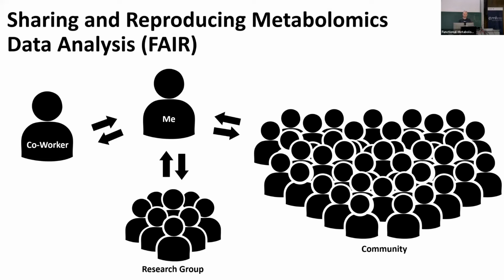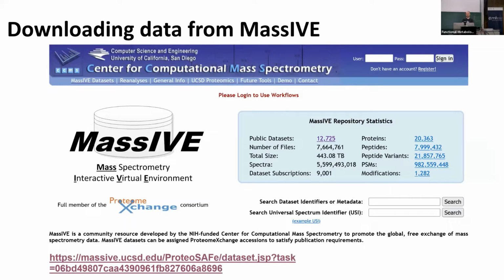All right. And one way, what we use in the lab, is the MassIVE repository. This is hosted at the University of California in San Diego by the main group of Nuno Bandeira and a couple of other people. To me, ease of use is the main convincing thing, because it's really simple. If you just type it in your browser, you can go to massive.ucsd.edu and then browse the public data sets.